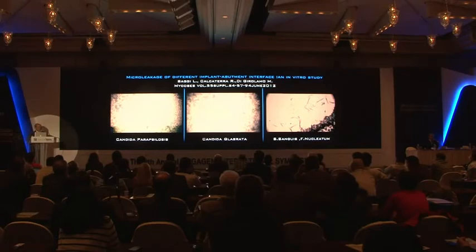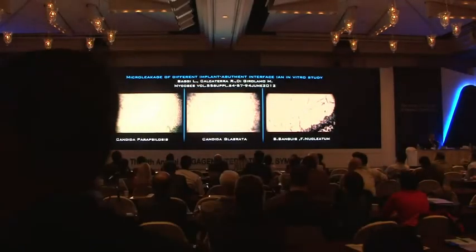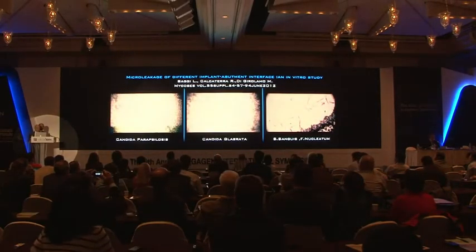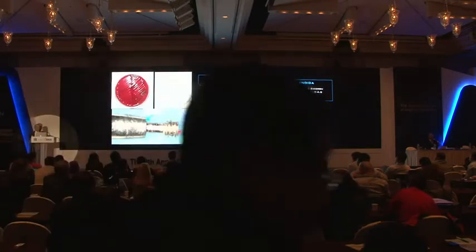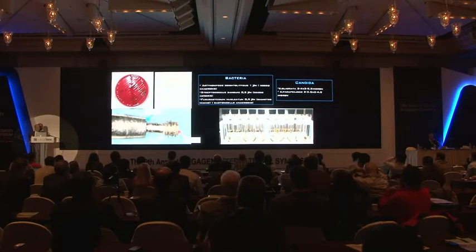One of the final investigations in this field that we performed in these years is an in vitro study on the micro-leakage of different implant-abutment interfaces, where we submerged the samples in a broth containing 3 bacteria and 2 types of candida to analyze the seal of the connections.